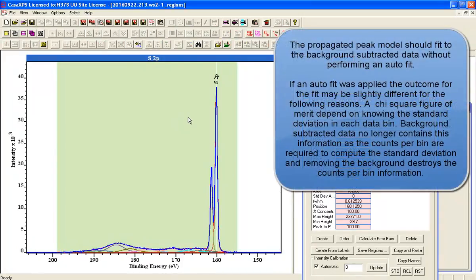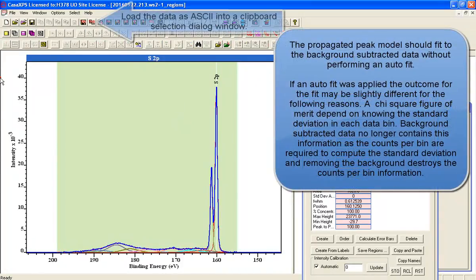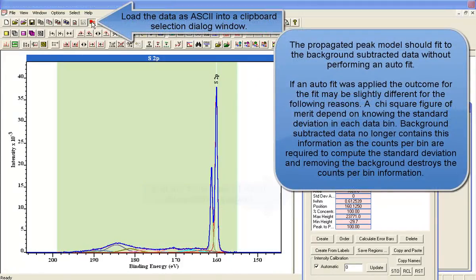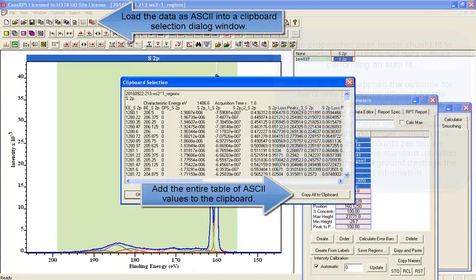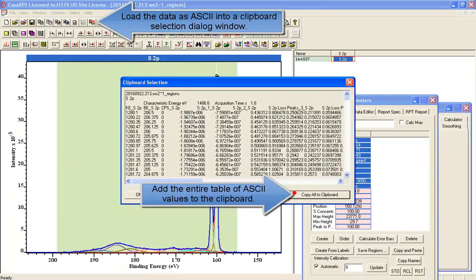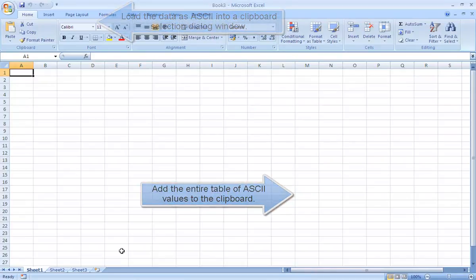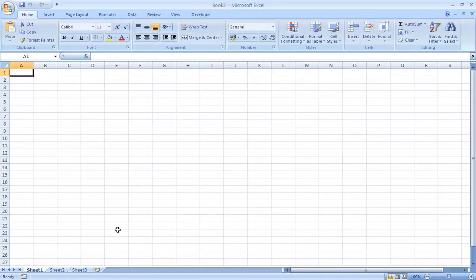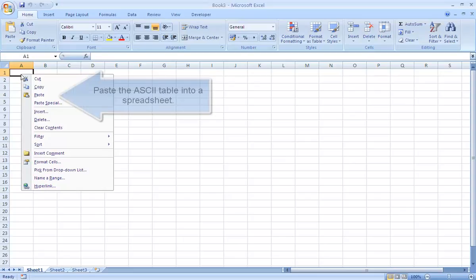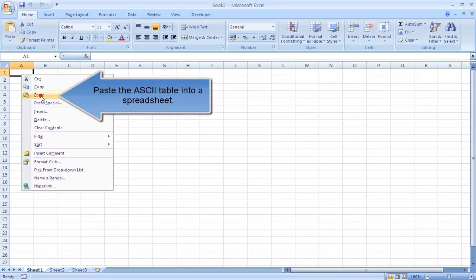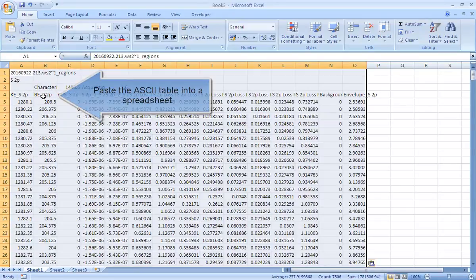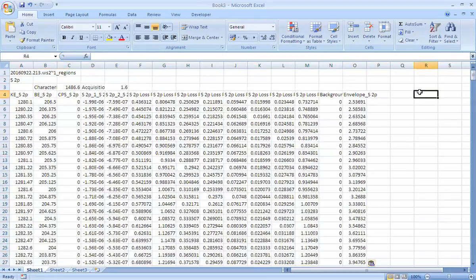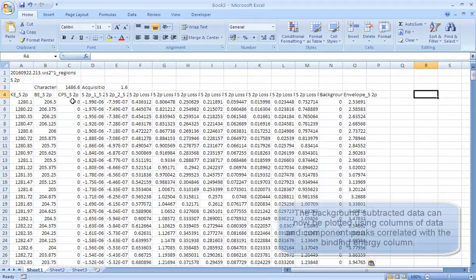And having obtained the peak model on the background subtracted data, we can use the toolbar button option for passing tab-spaced ASCII files through the clipboard and then you can paste them into Excel or any other spreadsheet program.